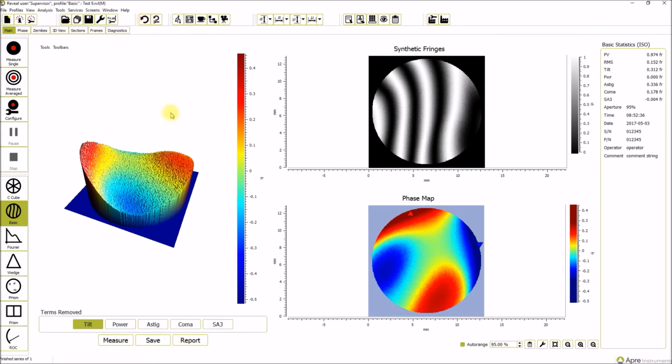Now of course, just taking data is one thing, but it's also important to save that data. So we can set up autosave functions so that as it's taking data, it's saving it, which is very important, of course. So what we do there is look at these file management icons. And in each grouping, you'll see there's this configure measurement file generator, and that's allowing each measurement to store a data set to memory, each sequentially. And what's very powerful is we can set up the system to save different file formats as we require.